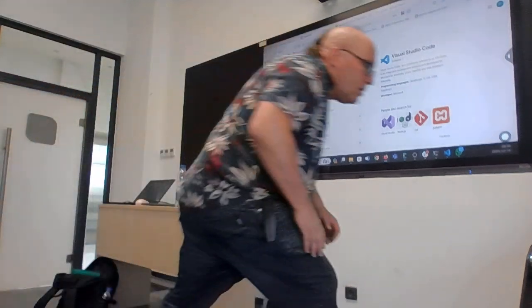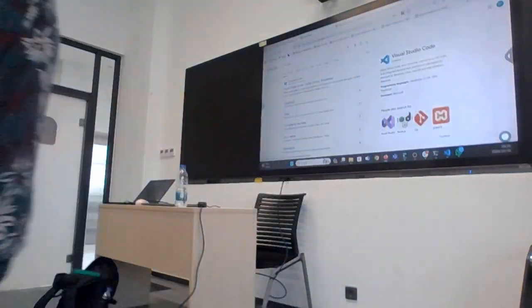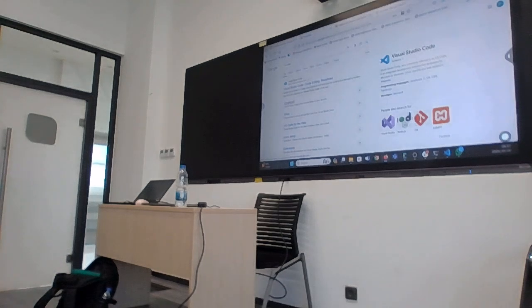Just the right one. That's correct. Put that on the WhatsApp. So can everybody download this software and install it on their computer? Okay. So can we?